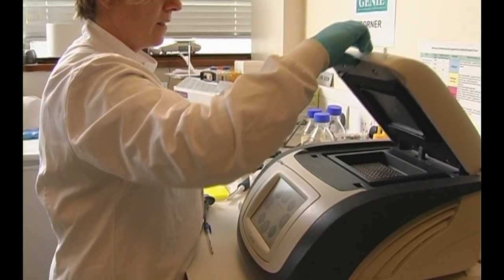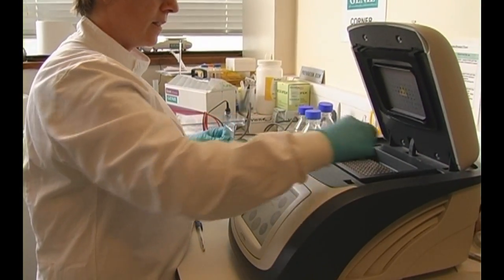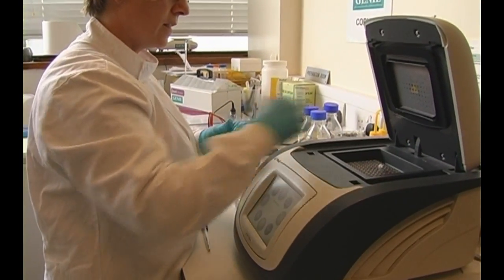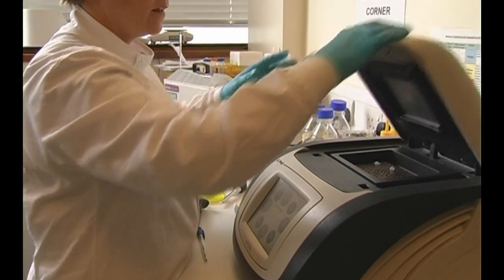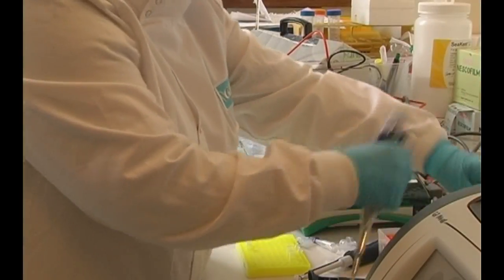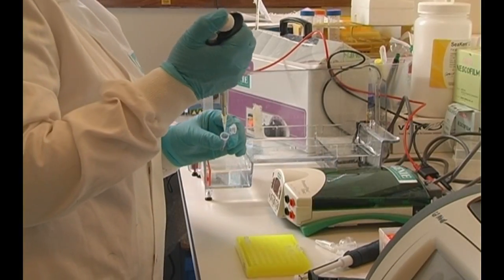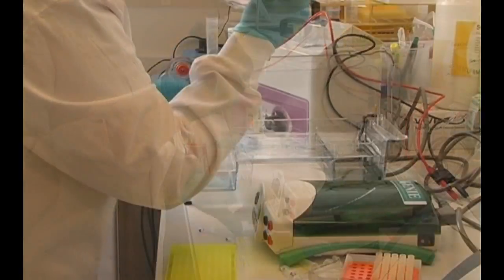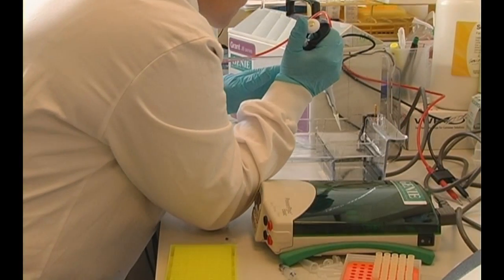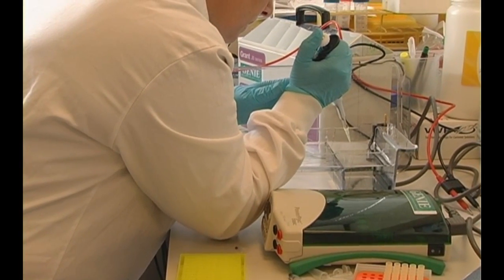Imagine you're an undergraduate studying medicine. You're watching a demonstration of the machines used for genetic testing. You've learned the theory, you know that medical conditions like cystic fibrosis and sickle cell anemia are inherited, and you know how they can be detected in people's genes, their DNA.